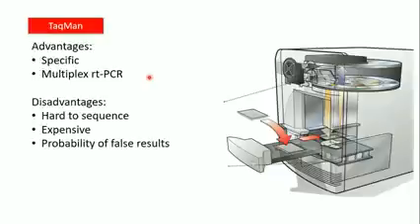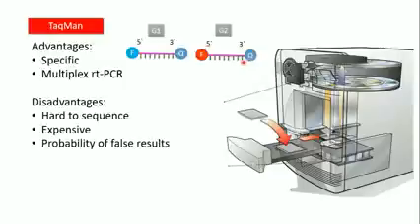It's to perform real-time PCR for many genes in one tube. And yeah, I can do this with the specific detector, because let's say we have gene 1 and gene 2. We can use two different specific detectors. The first is coupled with the blue fluorophore. The second is coupled with the red fluorophore.